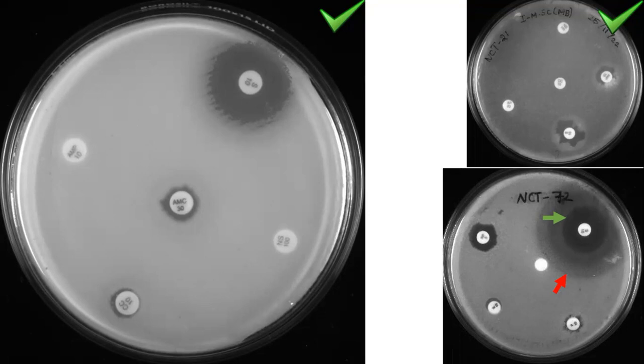Say 10 bacteria look unique. So I was working with 10 bacteria, and I have inoculated the 10 broth cultures. Now I am smearing the bacteria on Mueller-Hinton agar. I'm swabbing them, then placing 5 same antibiotics for all 10 bacteria in 10 plates. Most of my observation says if the bacteria are of different species, the antibiotic sensitiveness will differ.